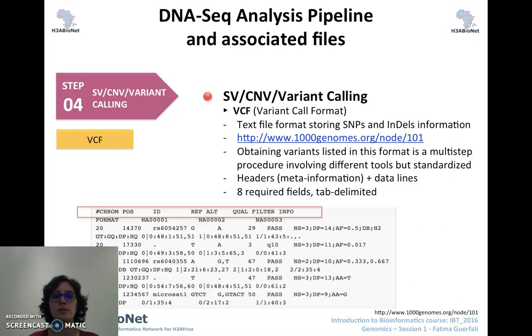Information about SNPs and CNVs would be stored in a VCF format. This is a text file format that contains 8 required fields that you can see here highlighted with the red box. You have the chromosome identification, then the position of the mutation, which is the POS, the second column. ID would list the unique identifiers, if they are available. Of course, if you have, for example, a database related to SNPs, then you would have a dbSNP variant, and you would usually find the rs number.